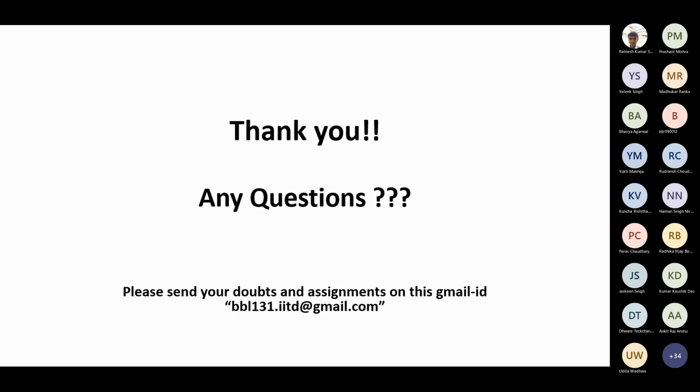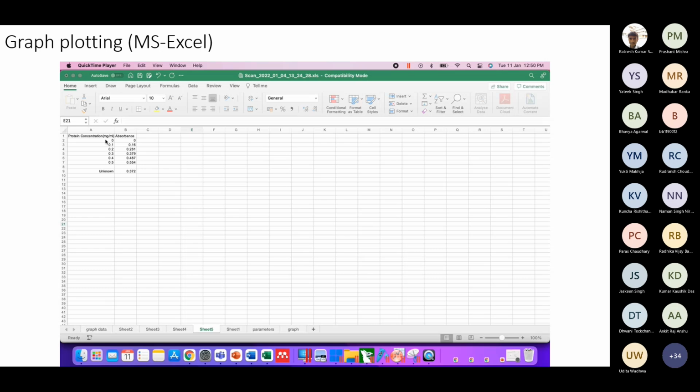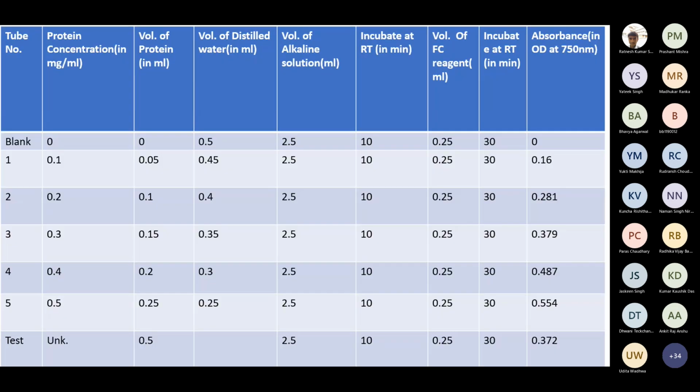So, if anybody has any questions, they can ask. Ma'am, initially we added solution 1, solution 2, and various other reagents. So, what is the significance of using each of them?